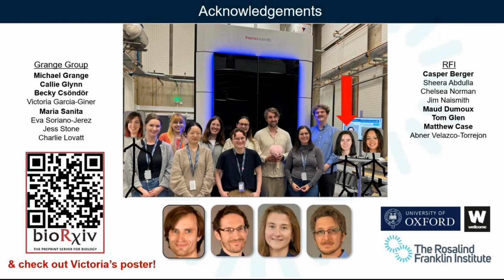Do you prefix your brain before cutting on the vibratome? No, it's just straight fresh from dissection and then into hemispheres, straight on the chuck. Kill a mouse, take the brain, slice it, and then put it in the high-pressure freezer. How long does it take? We normally do several sections, so it takes a little bit longer, like an hour, maybe 2 hours.